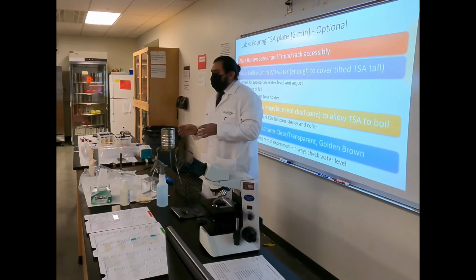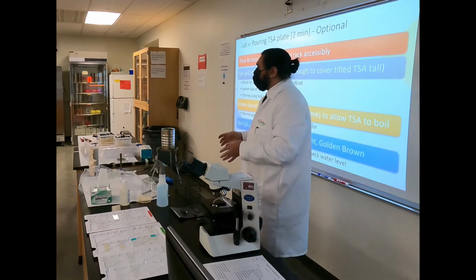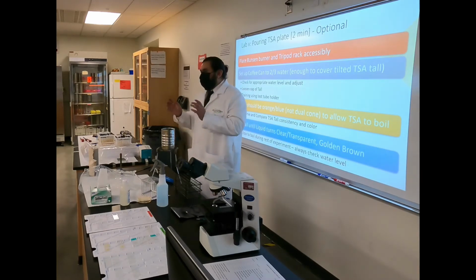And let it run. Now, make sure you find a place that you're comfortable with, specifically away from your scope, because you're going to be working on other stuff. Excuse me. So find a happy spot, don't drag, lift.